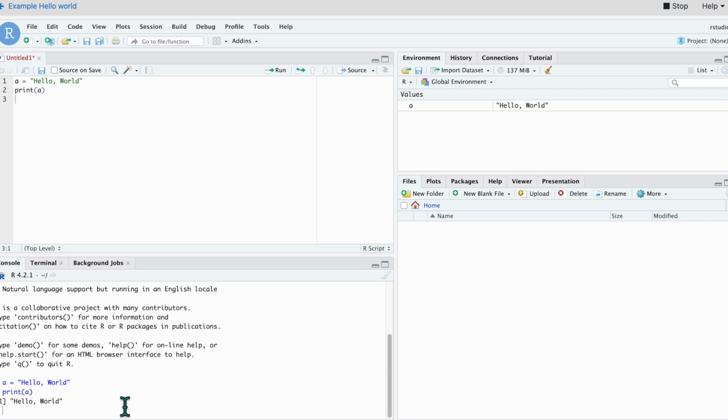We will cover these a little more in depth later, such as how to change directories, designate different output folders, etc. We will also delve into how to turn scripts developed in these different data studios into automatic tools and workflows for scaling up and different batch tasks. When you are done with your data studio, please remember to hit stop.